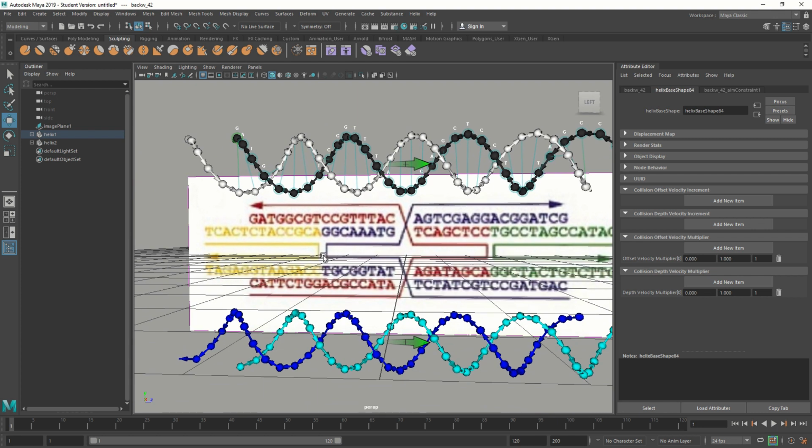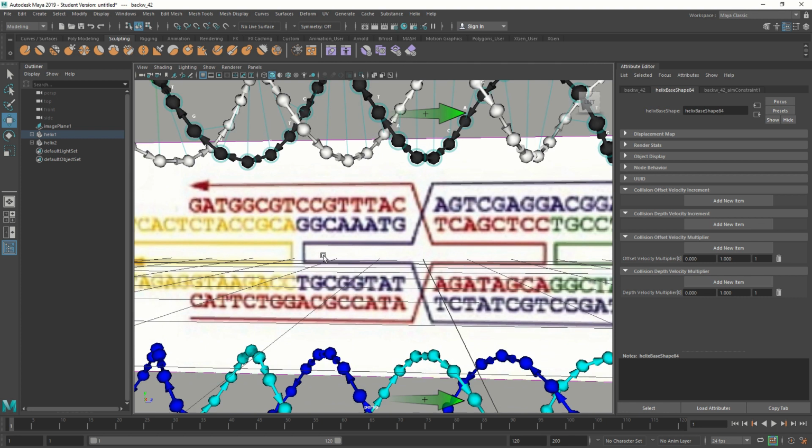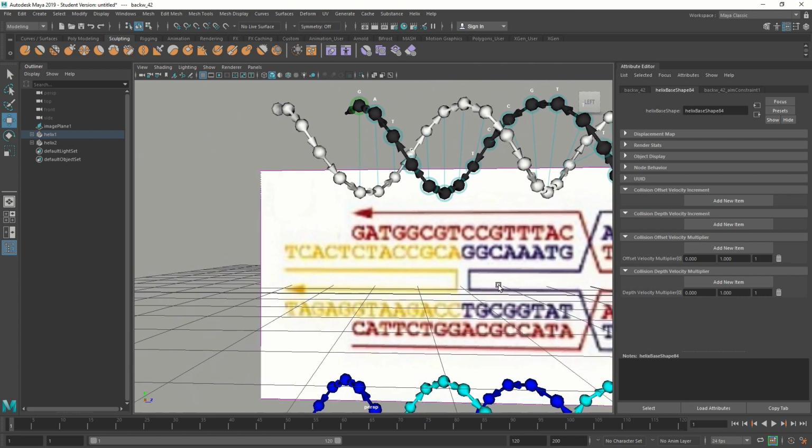And I will just start now that they are far apart and just apply the nicks. It's not necessary to apply nicks before you can just straightaway do the crossover, but I'm just going to do it here for clarity. So what we have here is the strand that will be the yellow one here, the one that is gray here. So it's the protruding 5' end. And after 13 nucleotides, there will be a nick here. That will be the connection to the other helix.